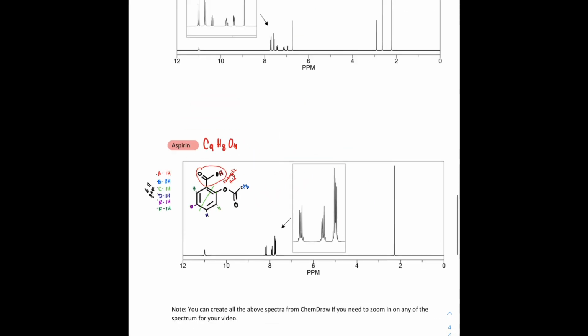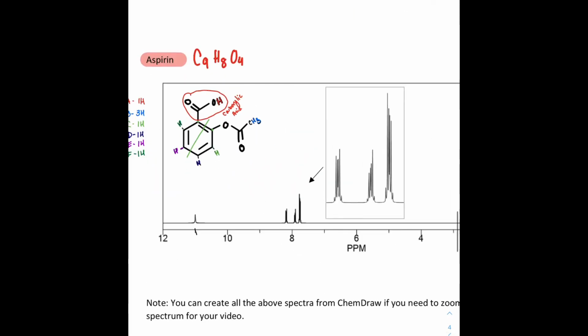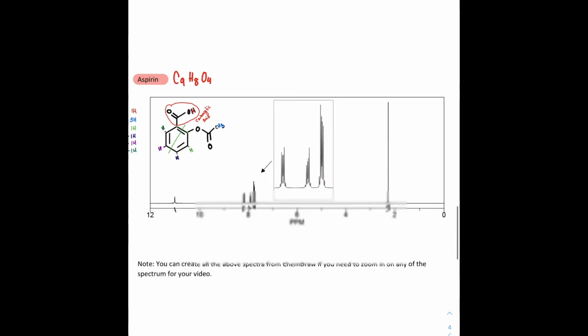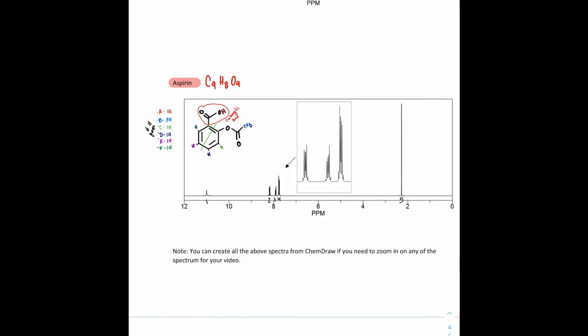So then we're going to zoom back out and look at this whole NMR, and we're going to count our peaks. We have 1, 2, 3, 4, and 5. And I bet you're totally panicking right now and being like, what are we going to do? Because we have 6 groups and only 5 peaks, and I also felt similarly until I actually started getting into the analysis of this compound, and then it totally will make sense later.